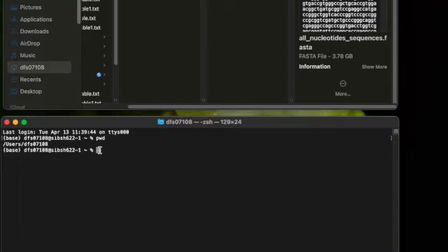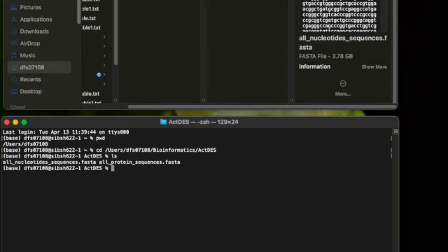Okay, so if you migrate to the current working directory that you need, okay, so cd. And you can see when you list those files that the all nucleotide sequences and all protein sequences FASTA files are in that directory. So you're working in the right directory.